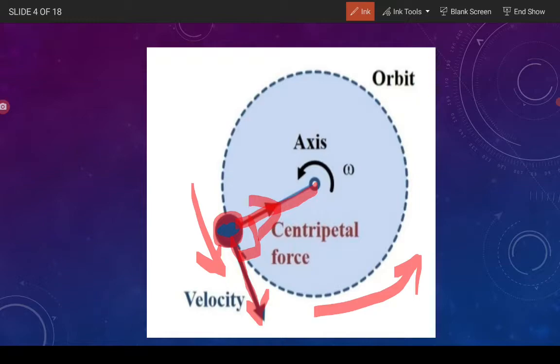So when these particles use the centripetal force, the molecules or particles sediment at a higher rate. By using gravitational force and the centripetal force, they increase the rate of sedimentation. That all happens by moving in a high-speed circular pathway.